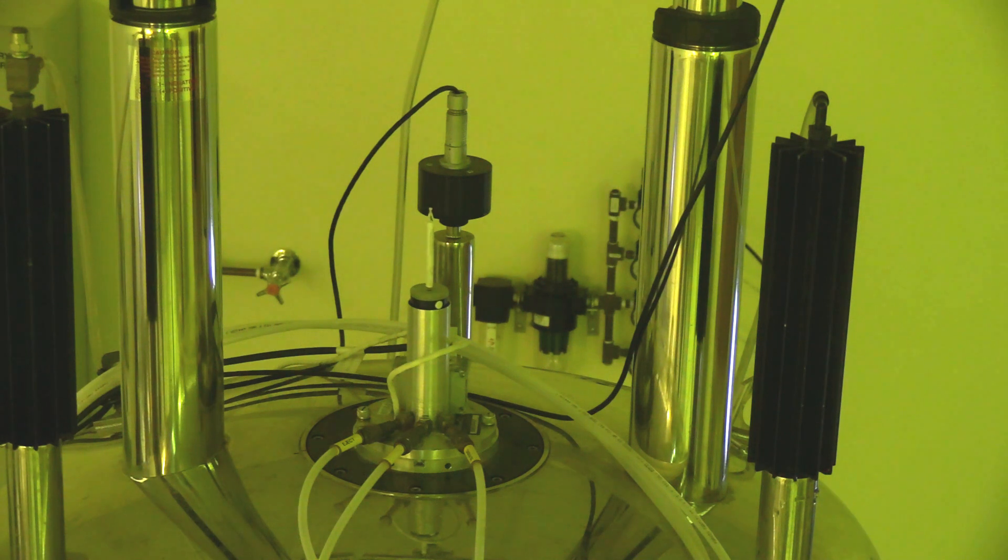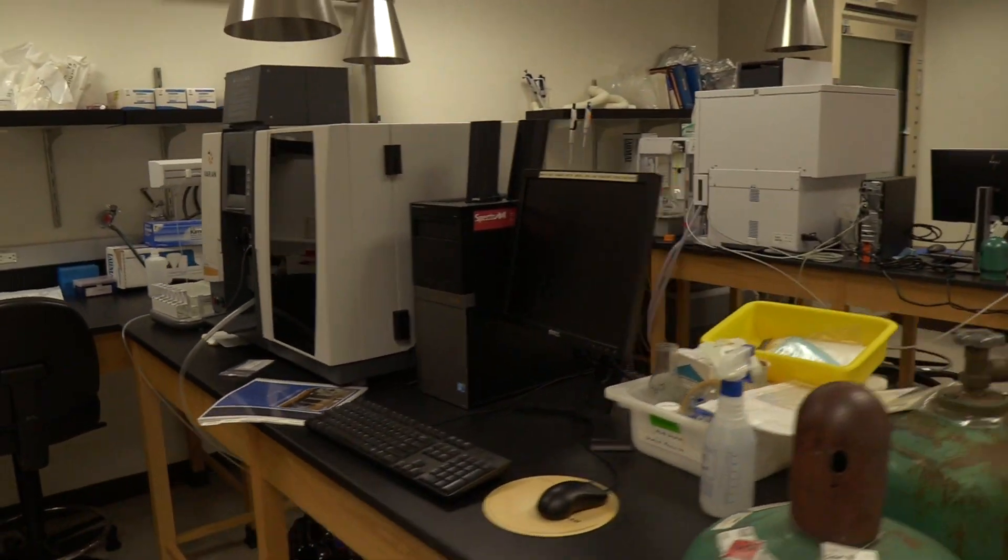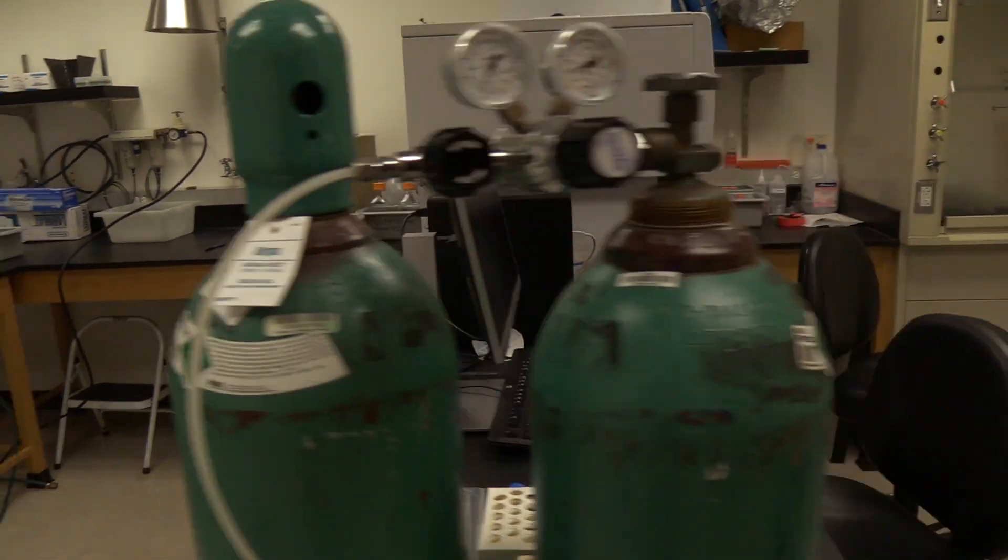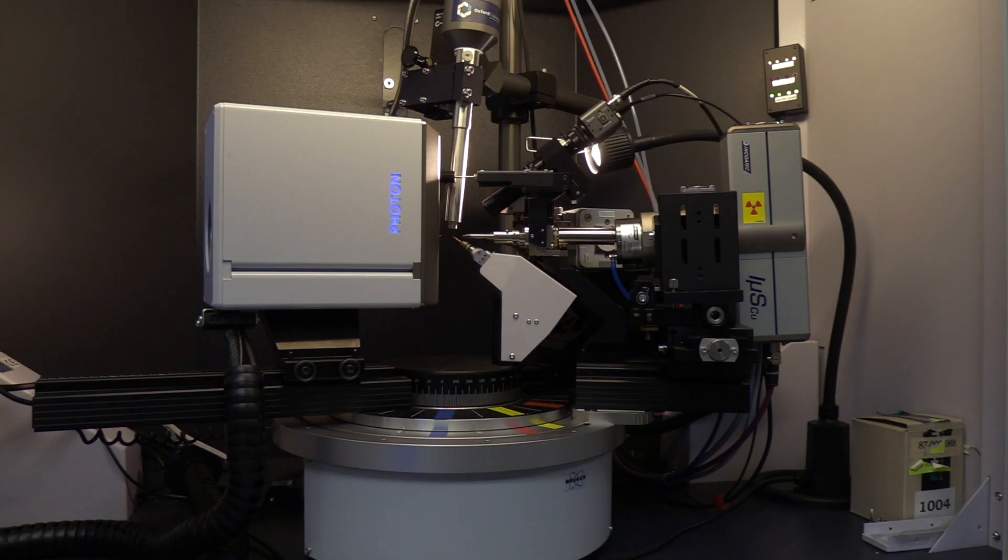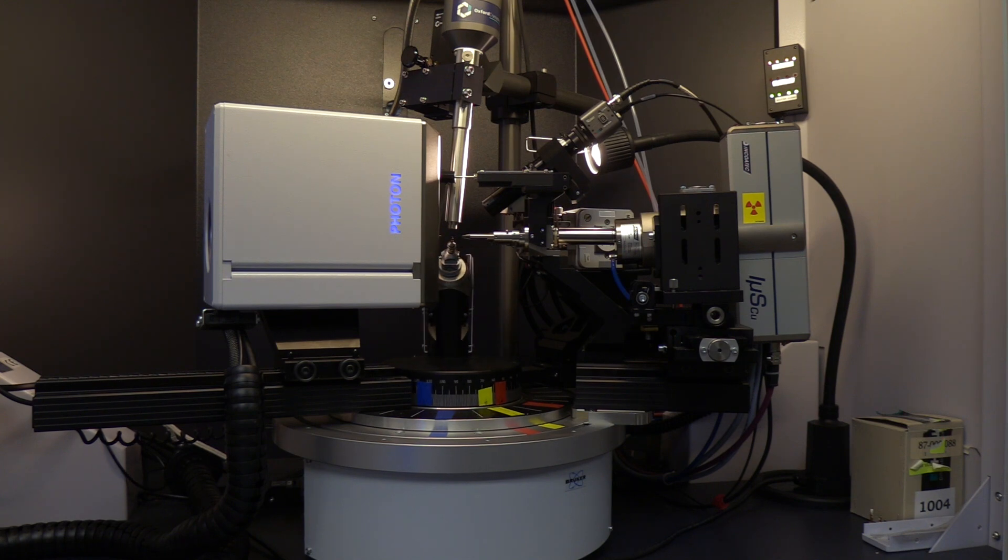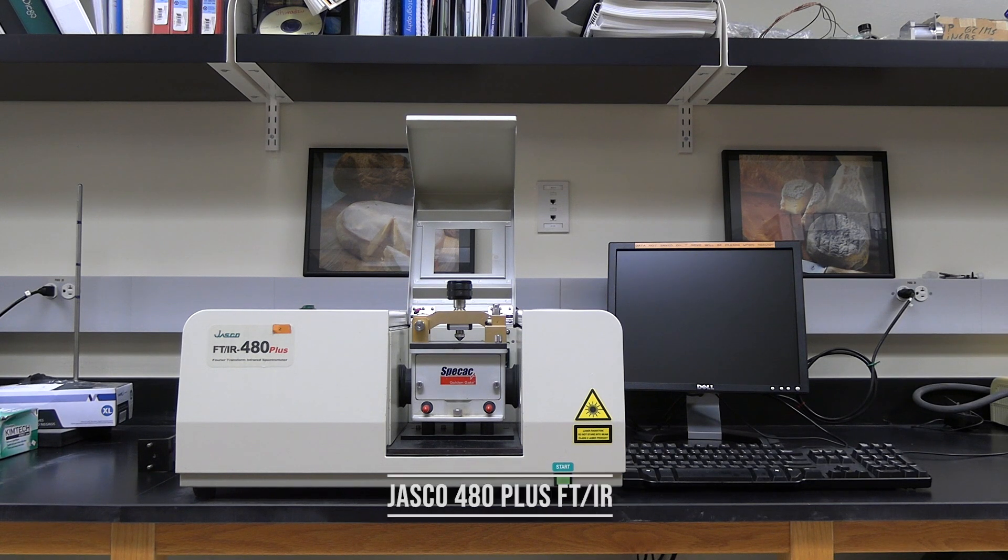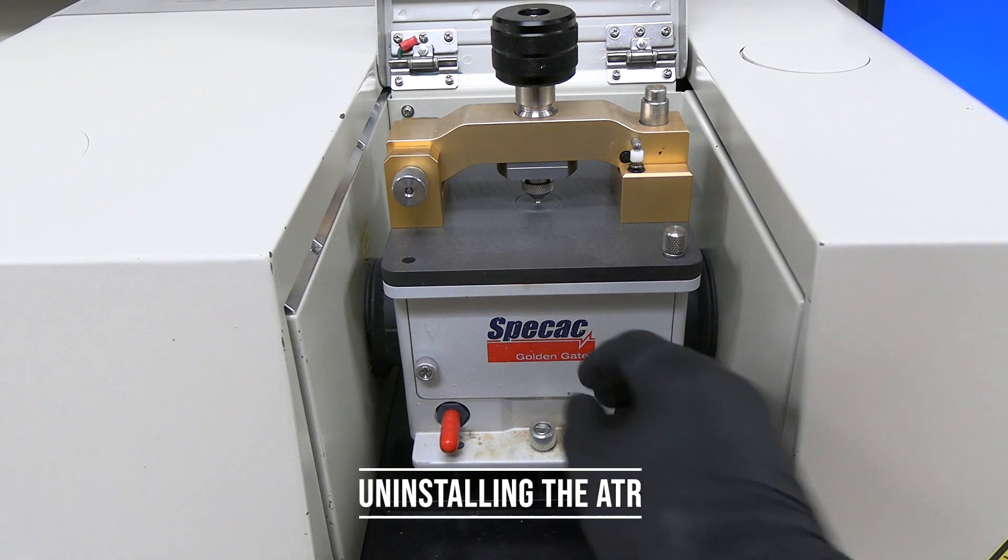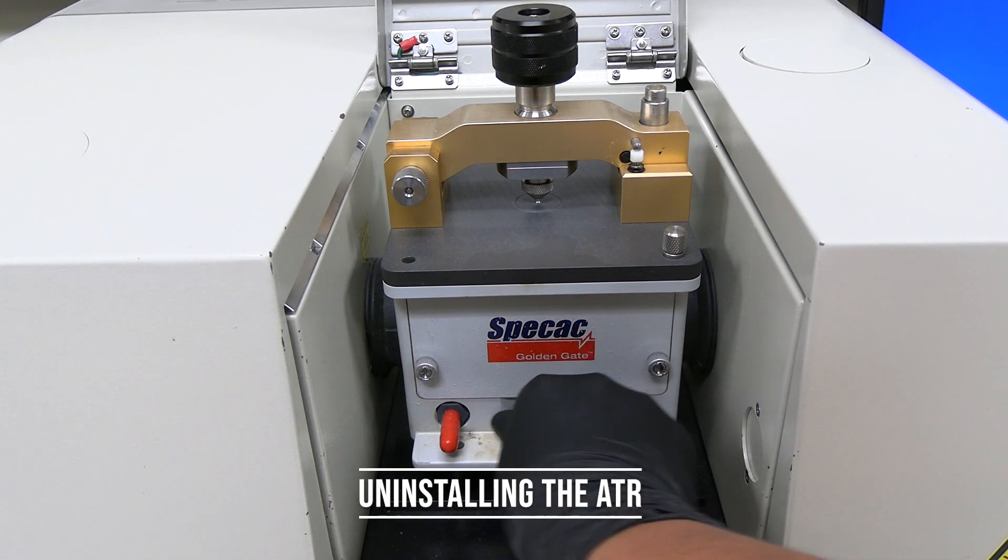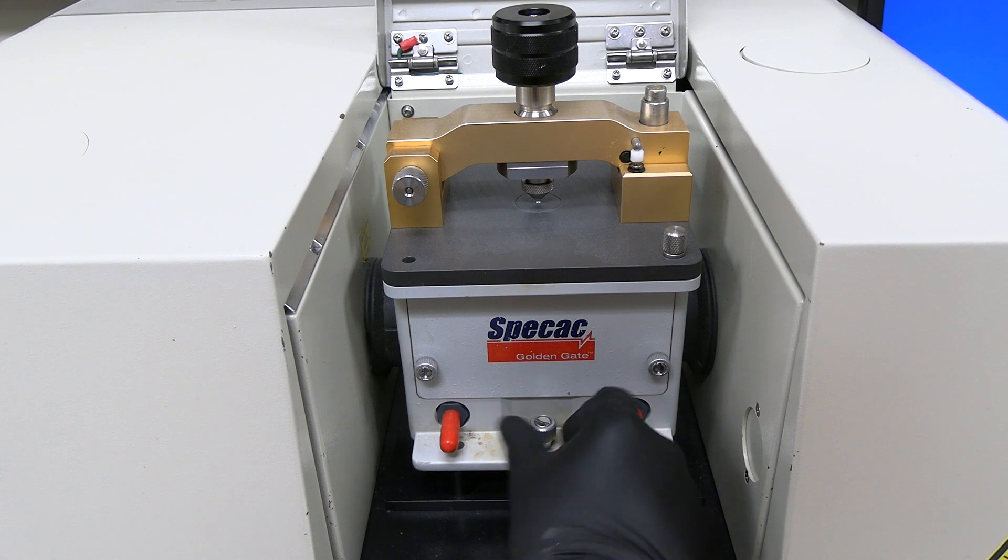Let's get started. Uninstall the ATR. The ATR is typically installed in the IR. To uninstall the ATR, turn the thumb screw counterclockwise.